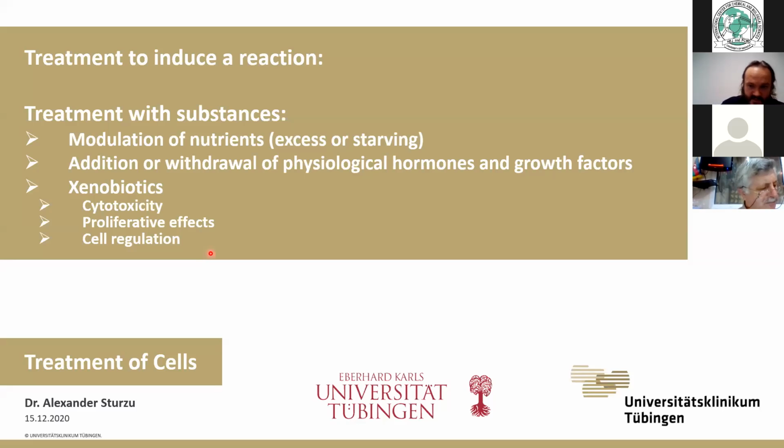This all can be studied and the effects seen, but what is more often done is to test foreign substances on cells and see their effects. The main thing we're looking at is the cytotoxicity. If these substances kill our cells, and should the substances not kill the cells, we can study what other effects there are. If there are any effects on the cell proliferation, cell growth rate, or if there are other influences on the cell regulation.